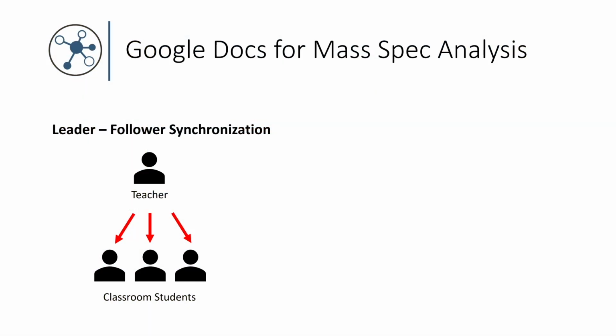We mostly meant it for classroom teaching, but imagine you have a teacher and a class of students, and the teacher can change the visualizations and all the students are synchronized to the teacher. That's kind of cool. But what's particularly unique about this is because it's following along in their own browsers, they can choose to stop following and then explore on their own. So they can build upon this particular visualization.